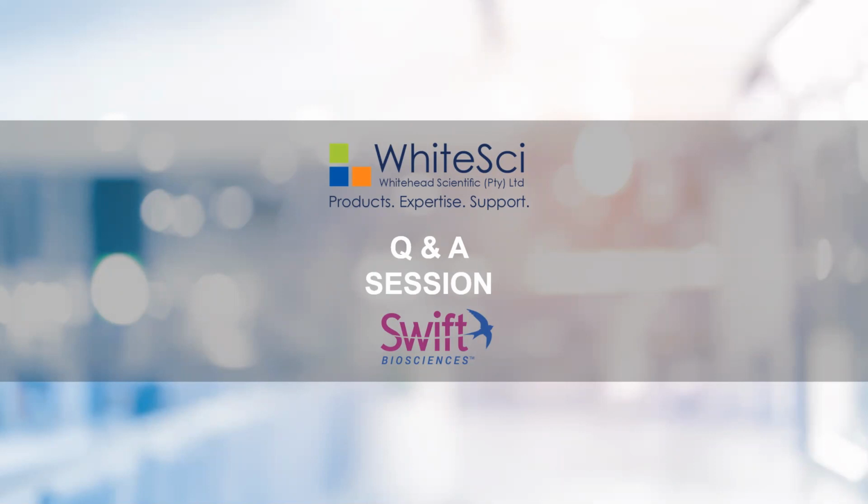Okay. Thanks, Gerardus. One final question. Would the panel amplify at least some of the other coronaviruses? Has that been tested? No, we haven't run a mixture of other coronaviruses. The answer is no, we don't know. We haven't tested it. We specifically selected the primers that would recognize SARS-CoV-2. But of course, if there are conserved regions, those would be amplified from other coronaviruses.